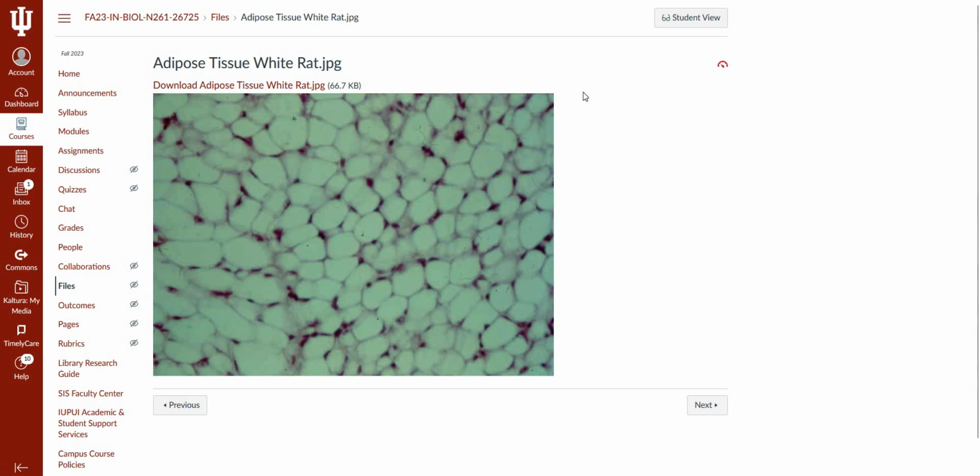And this is probably the weirdest connective tissue because it is mostly cells. So don't get it crossed with epithelium. This is still a connective tissue. So we're going to find it anywhere in the body that you store fat, which is all over. So that is adipose tissue. It's a great PowerPoint question because it's usually pretty easy for students to identify and distinguish from the other types of connective tissue.